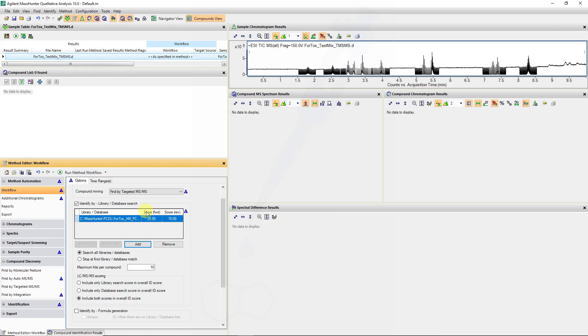Remember the forward scoring looks for library or spectral information in our unknown sample and compares that to the library. The reverse score looks in our library and compares that to our sample.